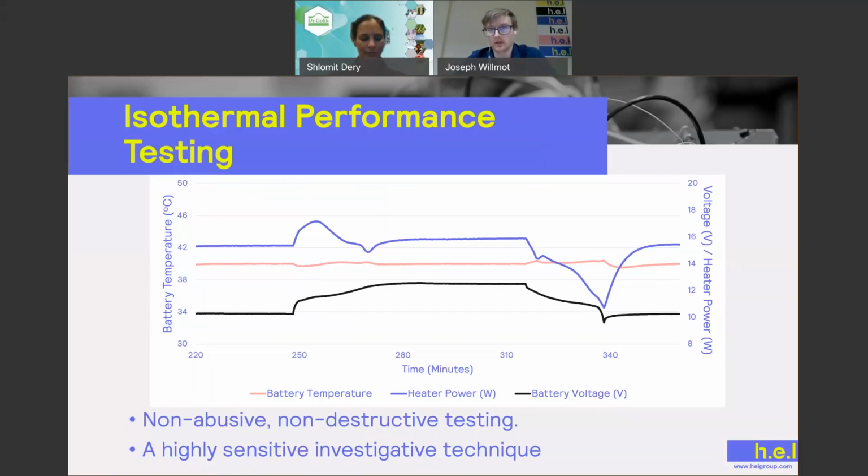With that, we've got this calibrated heater that's wrapped around the outside. So whenever we are performing a thermally dynamic duty on the battery, such as charging or discharging it, by however much we need to increase or decrease the power to that heater, we can therefore quantify the amount of thermal duty that the battery is undergoing.